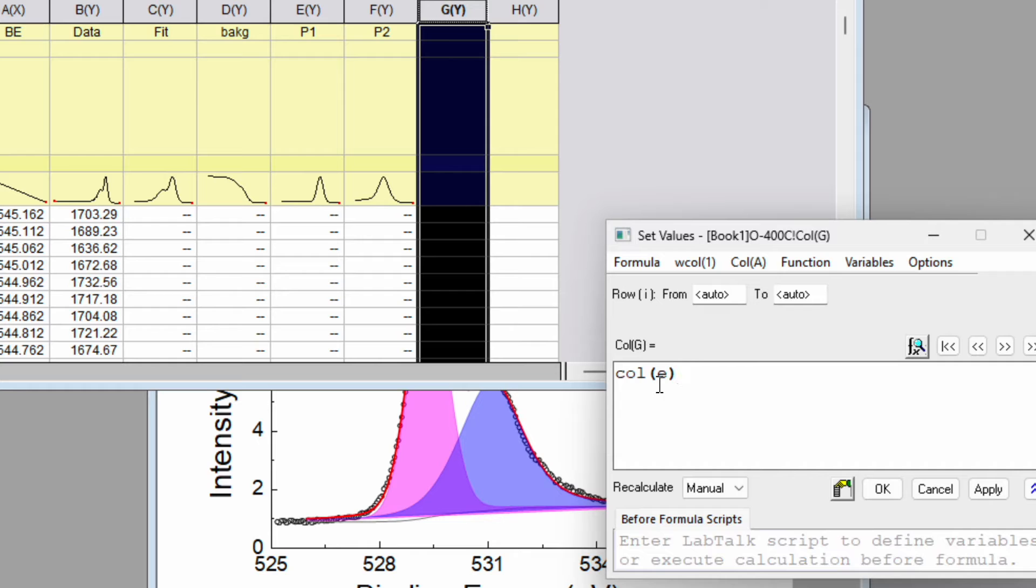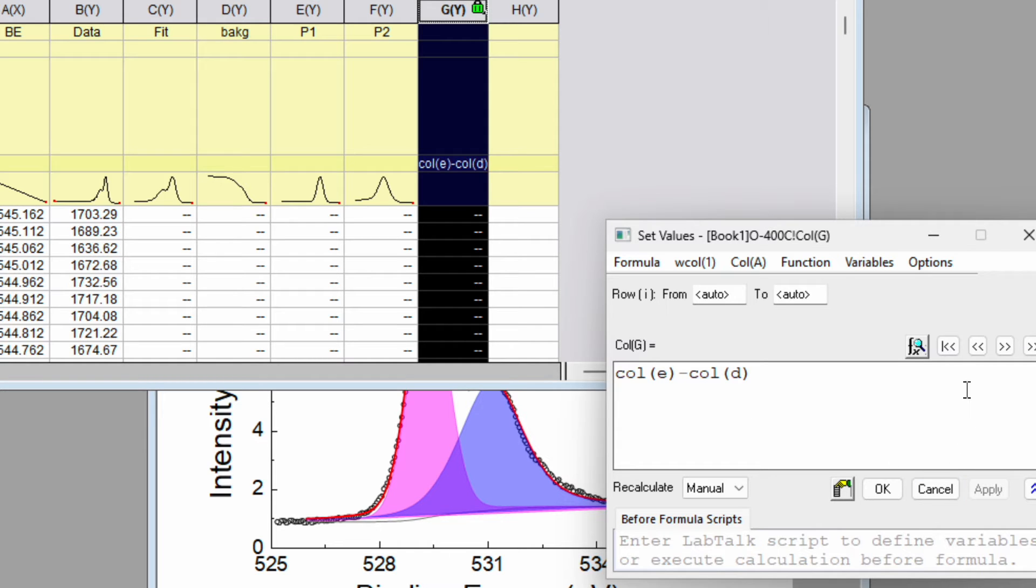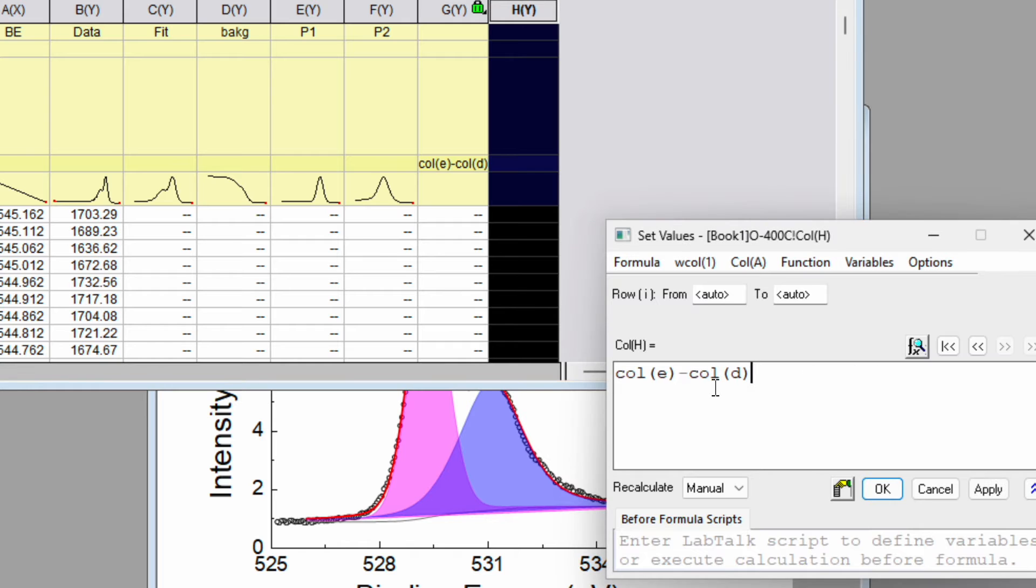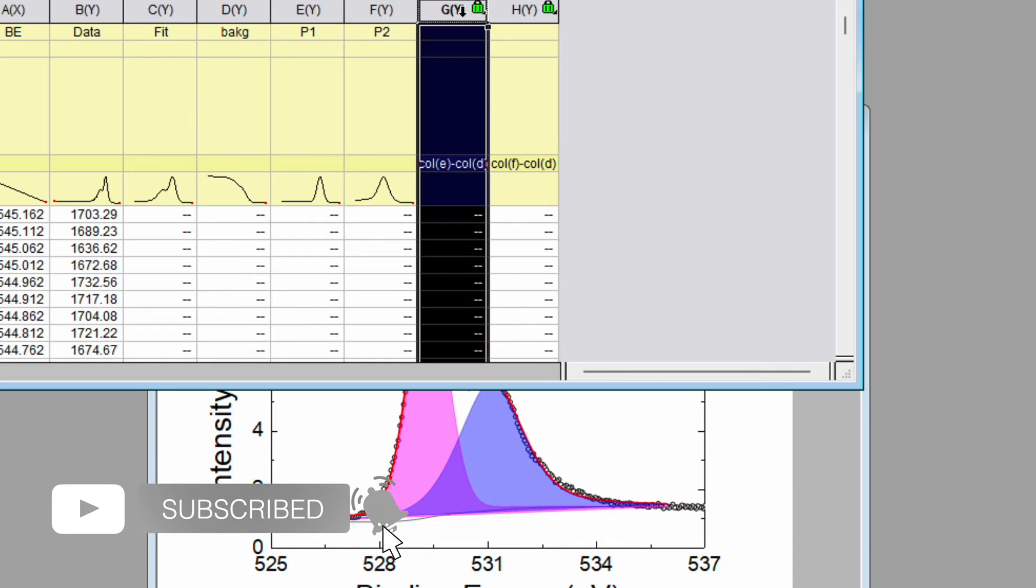Then go to the next value. Here it is column F minus column D because D is the background. So apply and OK. Now we got this peak. Click on the line and this is the peak p1.